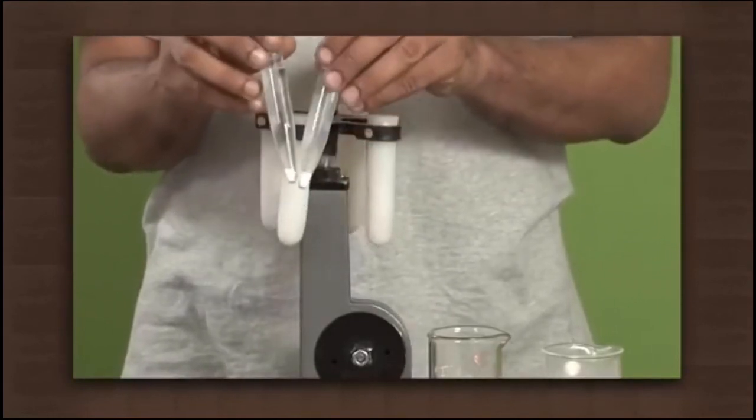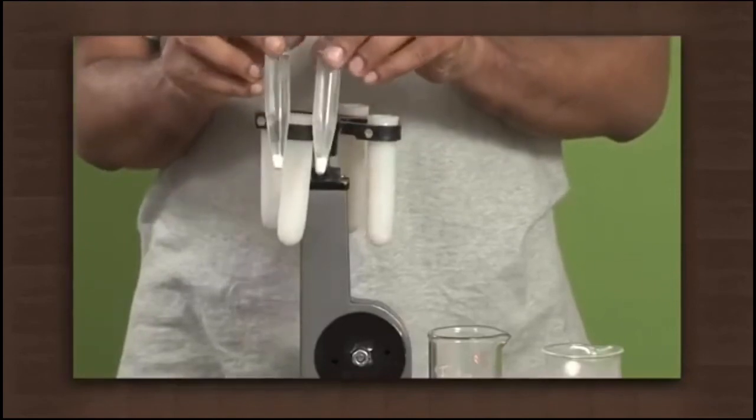This is the process of centrifugation. As you can see, centrifugation is the process where a mixture is separated through spinning. Centrifugation is used in diagnostic labs for blood and urine tests.